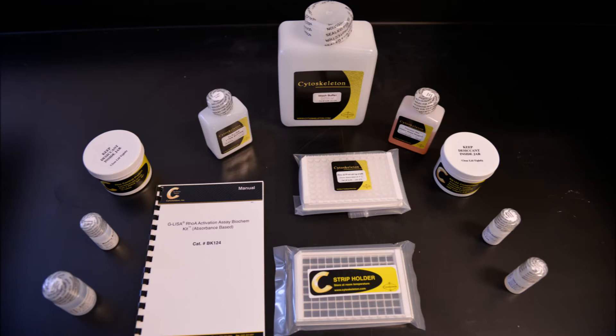Equipment needs are tissue culture supplies, liquid nitrogen, room temperature and cold room orbital plate shakers with a 200 to 400 RPM capability, vortex and a spectrophotometer capable of reading at 600 and 490 nanometers, or a luminometer if a luminescence kit is purchased.